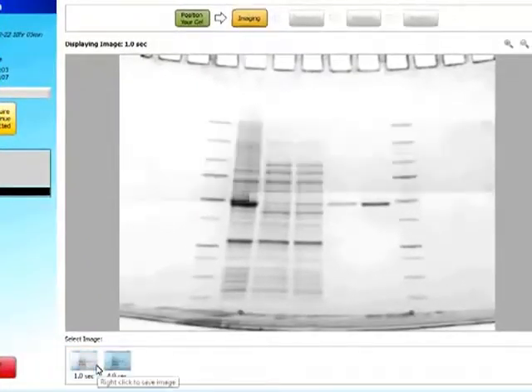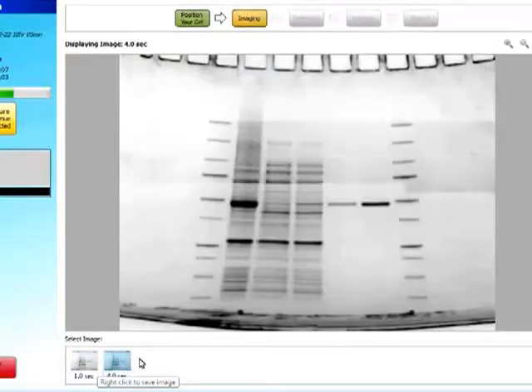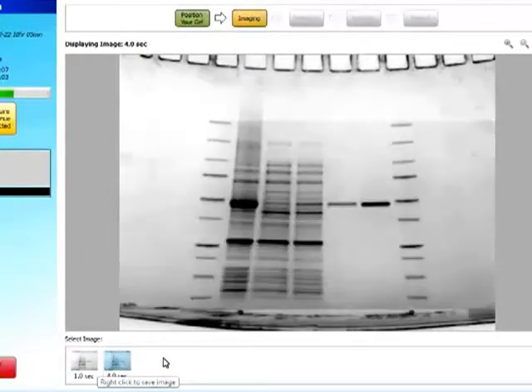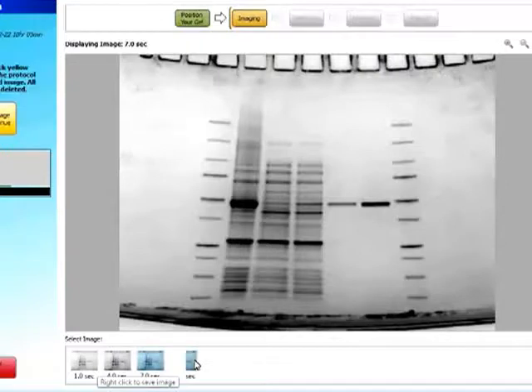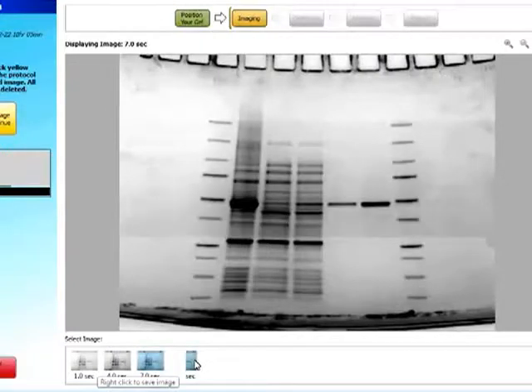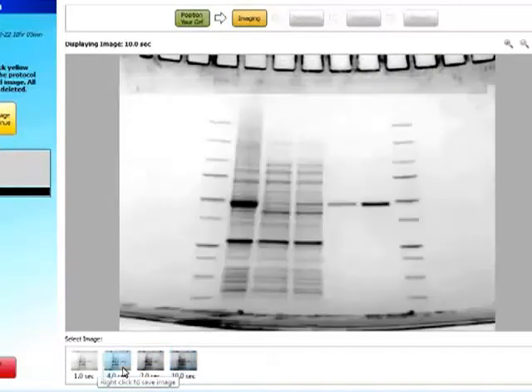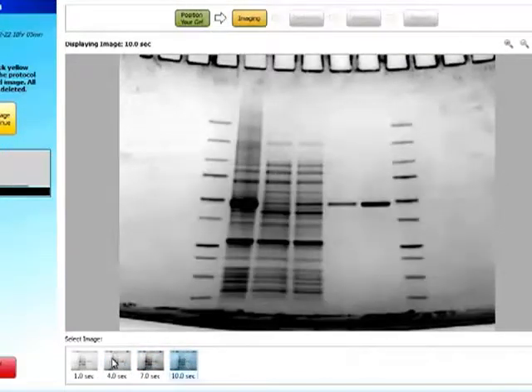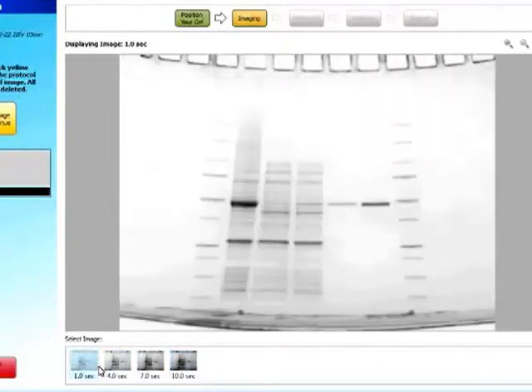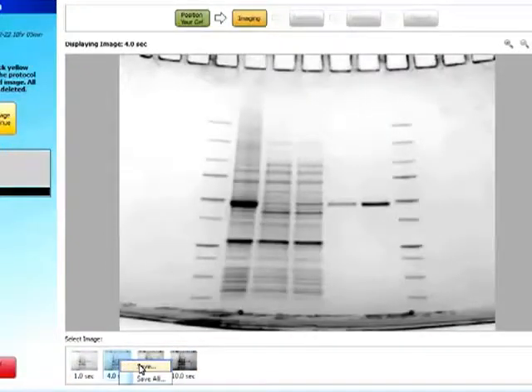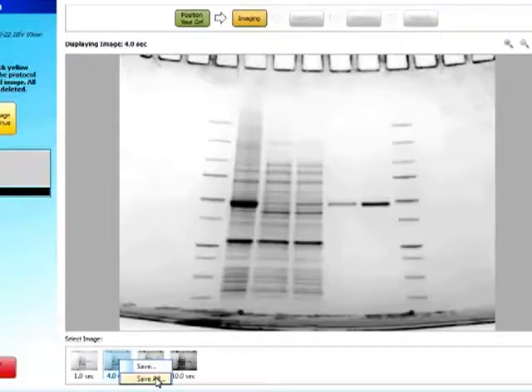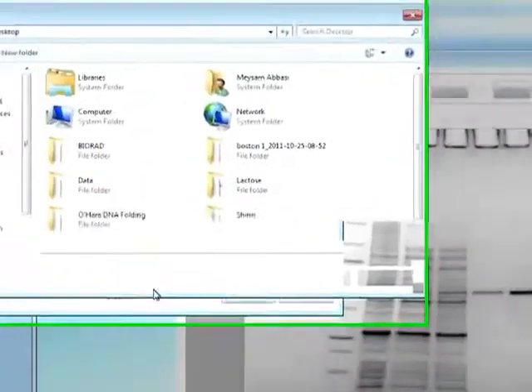So first one second, and then the image at four seconds, and seven and ten seconds. So there, now I can look at each of my images.